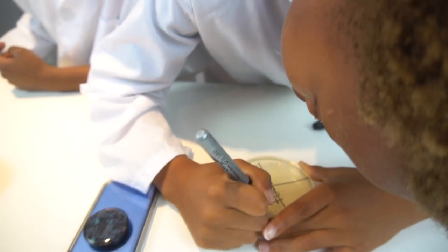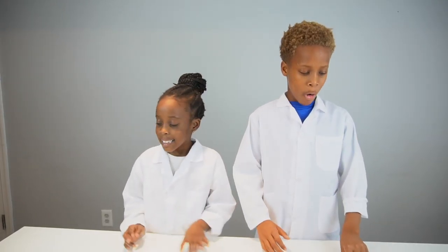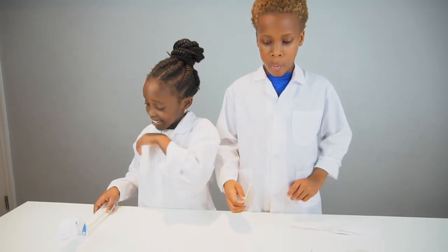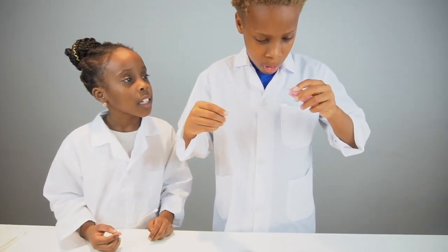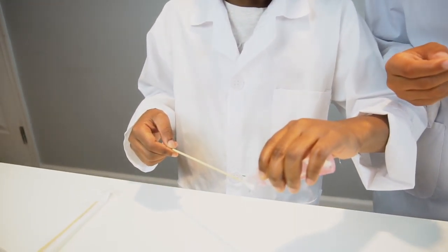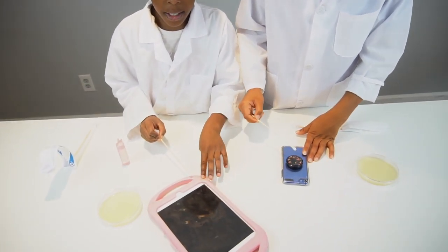Make sure you swab on each side, because if you don't it's not going to come out very good. Open up the cotton tip, but make sure you don't touch the cotton part. Then we're going to squirt a little bit of saline on it to make it moist. We're going to rub it on the part we usually touch a lot — I usually touch the handles, and I usually touch my pop socket.